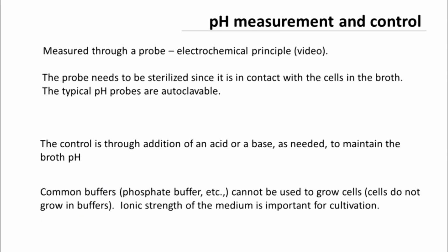One can always ask about these so-called buffers: phosphate buffer, acetate buffer, citrate buffer, and so on, which are designed to withstand huge assaults to their pH value, and they maintain the pH value at that set point through chemical mechanisms.